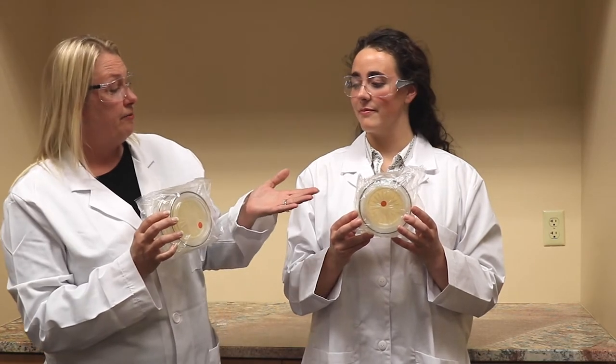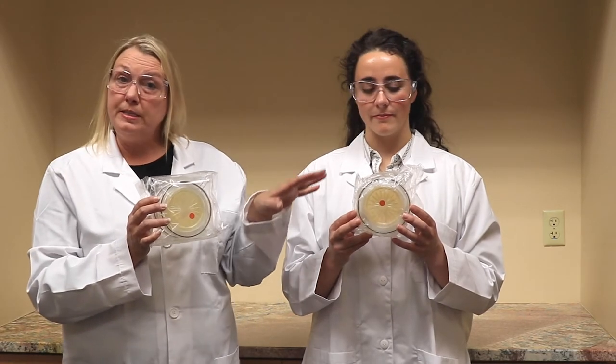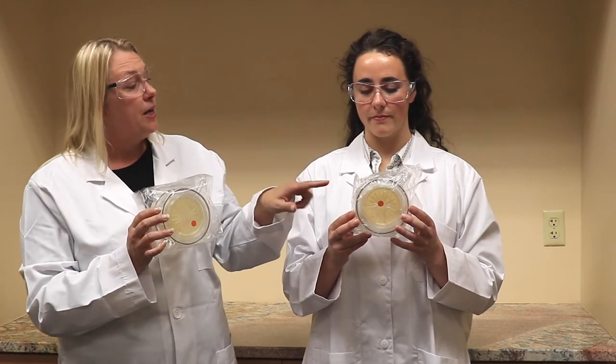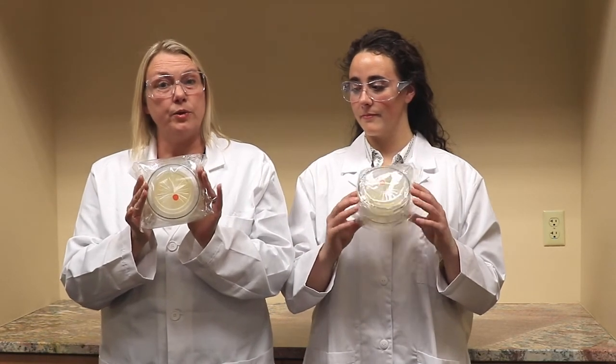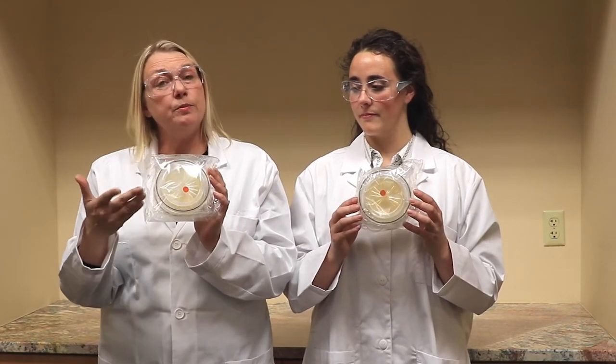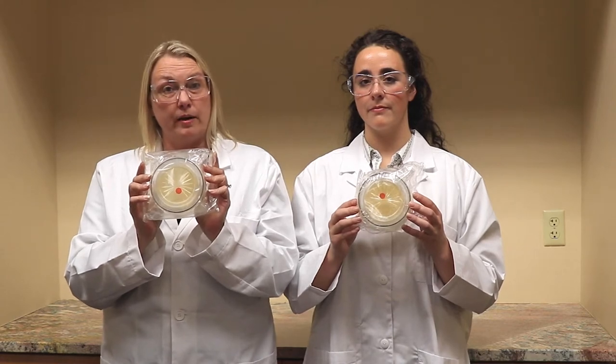Lexi is holding our 25/50 liter per minute BioCap Single Use. These are the ones that you've been seeing for years now — they come in packs of three — while I'm holding our new BioCap Single Use. These are for 100 liter per minute and they come in packs of two. We're going to open these packs and show you more about each of these products.